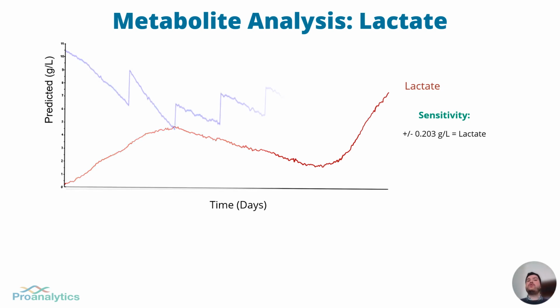And now let's just overlay the data from the previous slides. And it is what you expect during a normal fed batch process. Glucose goes down and lactate goes up. The reason for the sawtooth design of glucose is an addition to the reactor by a feed pump. You're adding glucose, but lactate is the final metabolite, produced or secreted by the cells after they consume the glucose.